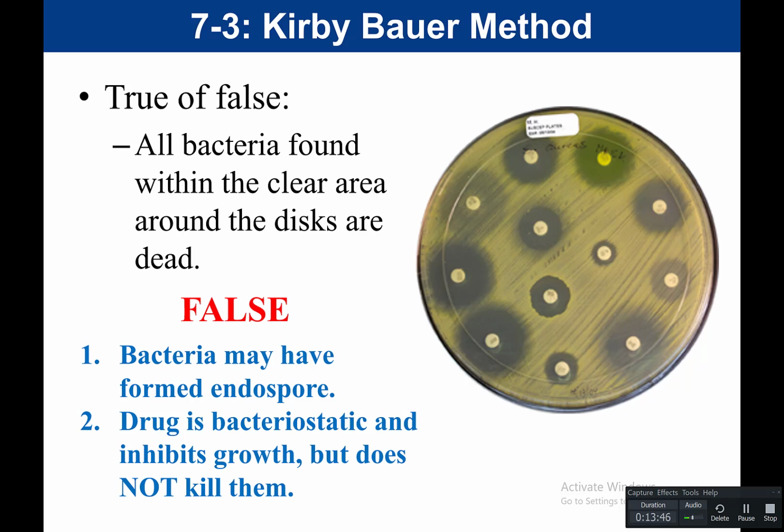If you recall the composition of gram-negative bacterial cell walls, you will recall that within that outer membrane is a chemical called LPS, lipopolysaccharides. And within the LPS, part of that includes something called lipid A. Lipid A is an endotoxin.